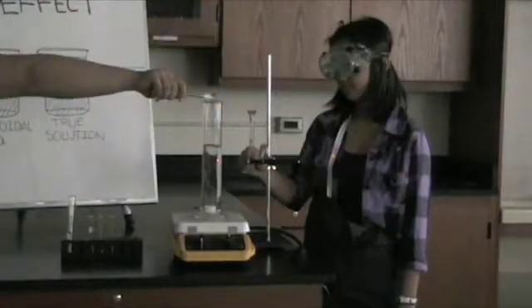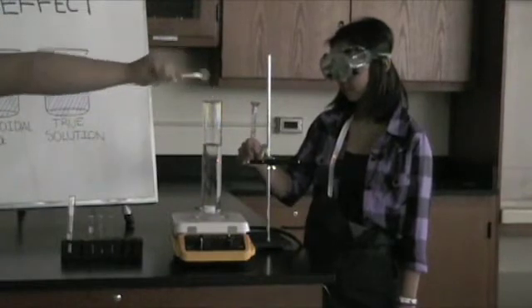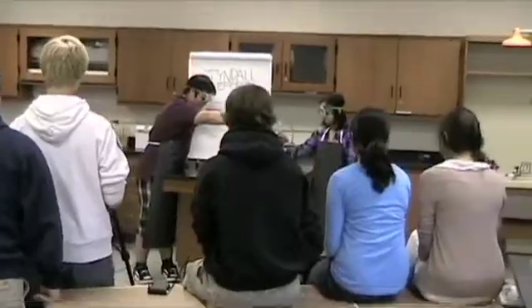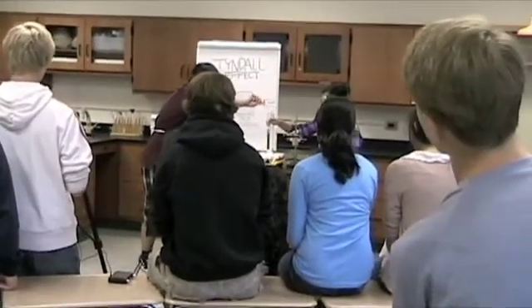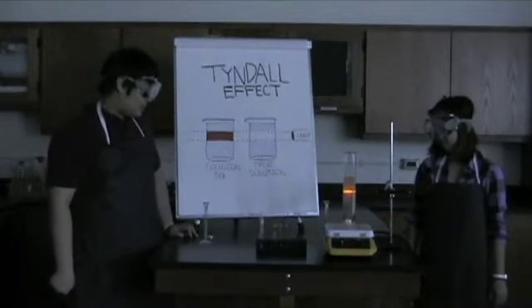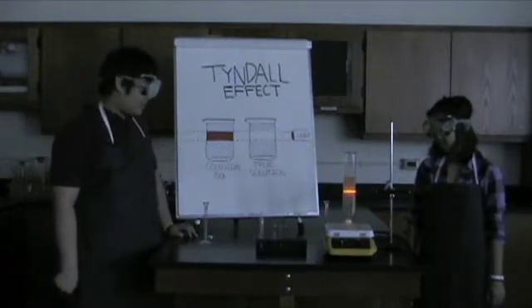Let's try a reaction. I just added in sodium carbonate. I'm adding in the silver nitrate. Cool. That beam being formed is because we precipitated out silver carbonate, right?